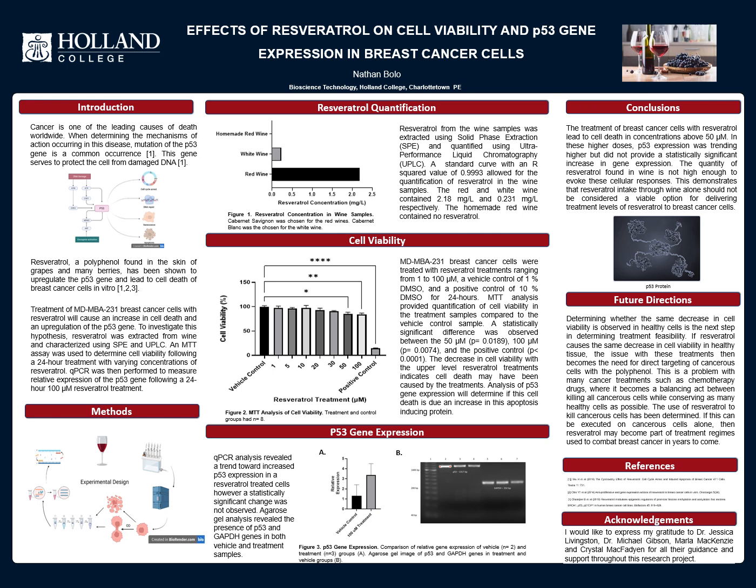Many treatments have been investigated to determine their effects on the cancerous cells and the regulation of their p53 gene. Resveratrol, being one of those studied compounds, is a polyphenol found in the skins and seeds of grapes and other berries. Some of the highest concentrations of this compound are found in wines. In this research, MDA-MB-231 breast cancer cells were treated with resveratrol to determine the effect it has on cell viability and p53 gene expression.